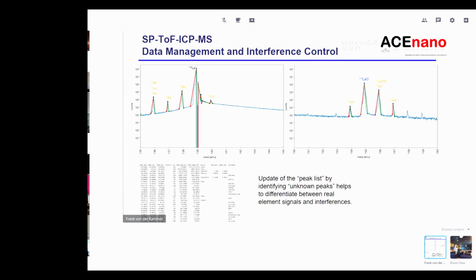At the University of Vienna, we were aware of the fact that when you're measuring the whole spectrum all the time, interferences become as important as they were in the early times of ICP-MS development, because the use of reaction cells doesn't always help in that case, and sometimes the resolution, although it is quite high, doesn't allow you to separate isobaric or polyatomic interferences.